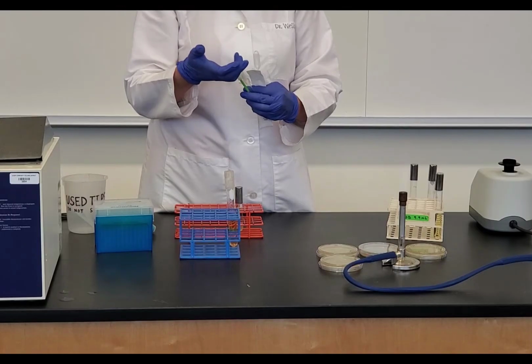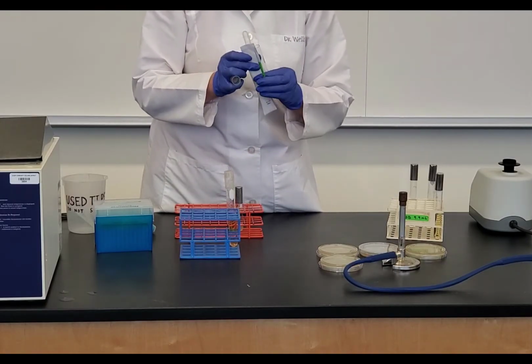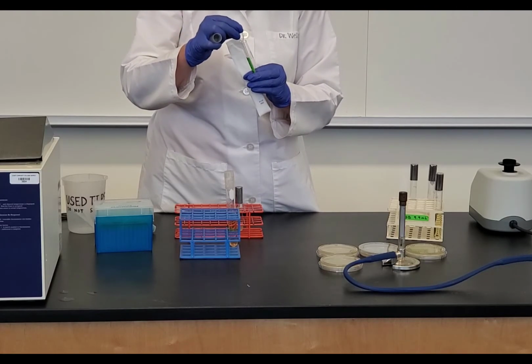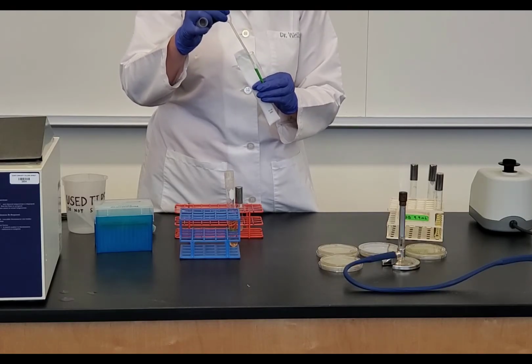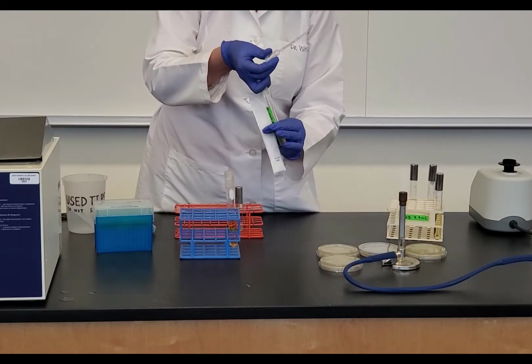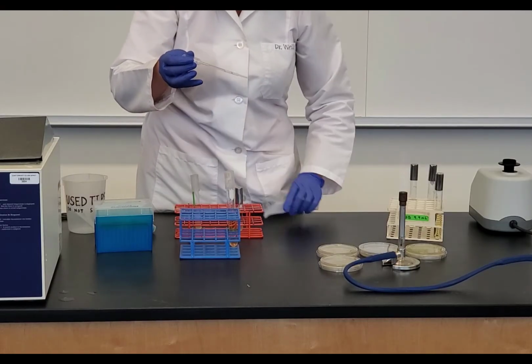Take my cap between the pinky and ring finger, and I'm going to flame the opening of the tube. I'm going to put my transfer pipette in my E. coli, and draw liquid up to the 0.5. Now I let that go. I'm going to flame it, cap it, and set it here for a second.